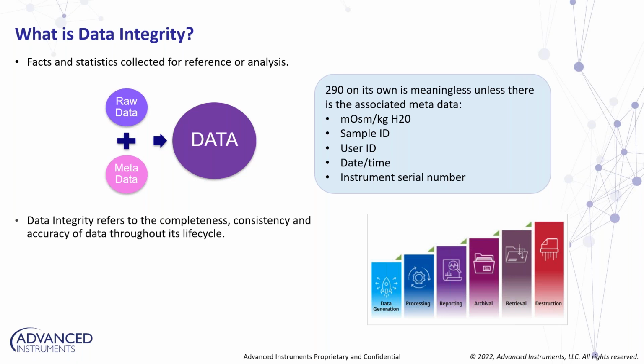Just to give you an idea, in 2018, one of the top reasons for FDA drug GMP warning letters was the lack of data integrity. So FDA is taking this seriously. Most of your internal organizations, I'm sure, are spending time on addressing, hey, how do we make sure everything is happening and everything is controlled and there is no room for error?